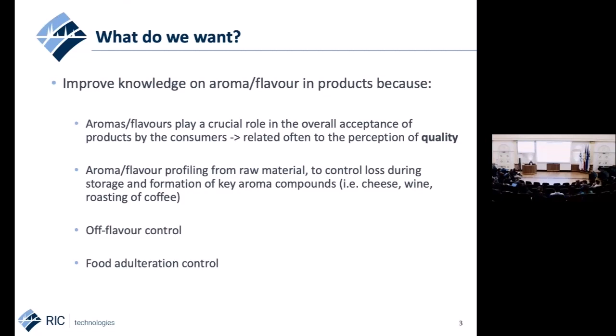One additional thing is that nowadays aroma profiling is very often used in food adulteration control. There are several studies which have shown that through aroma profiling we can actually distinguish between a genuine product and a counterfeited one.